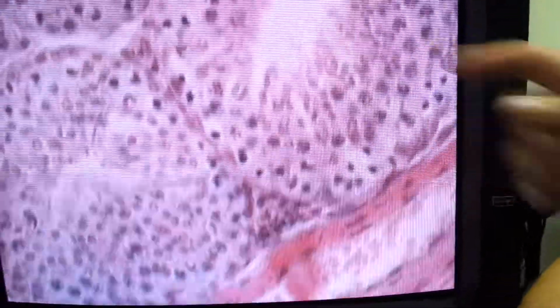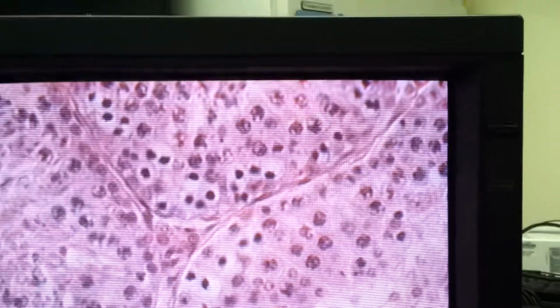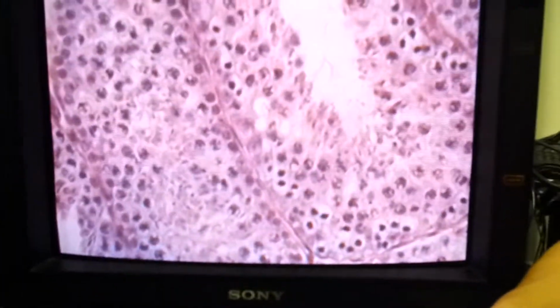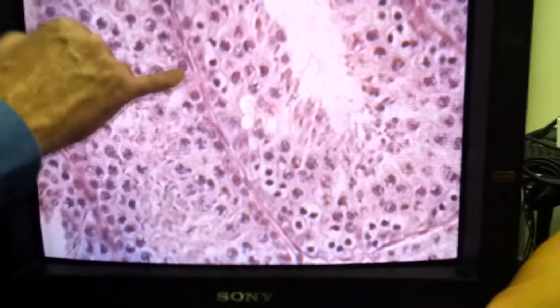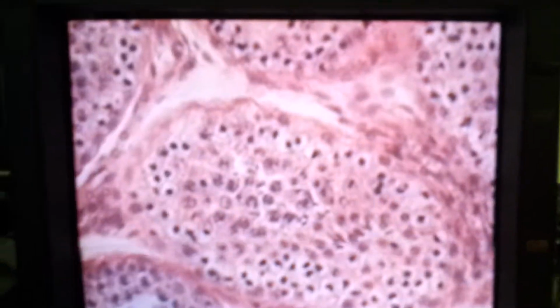Well, that's an interesting question. It doesn't really push anywhere. It grows toward the middle. It's moved toward the middle as it's attached to a Sertoli cell. And some of these elongated cells are myoepithelial cells, though they don't show up really well. So there is actually some contractility to wash the sperm out toward the epididymis. For sure, there is a net movement of fluid so that the sperm, as they mature and detach from the Sertoli cell, are washed out toward the epididymis. They can't use their flagella yet. That doesn't happen until they're in the epididymis.